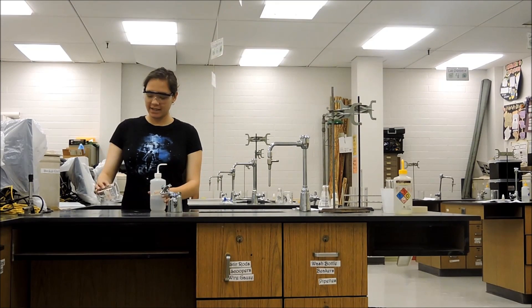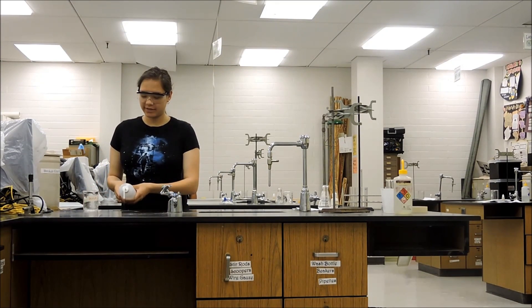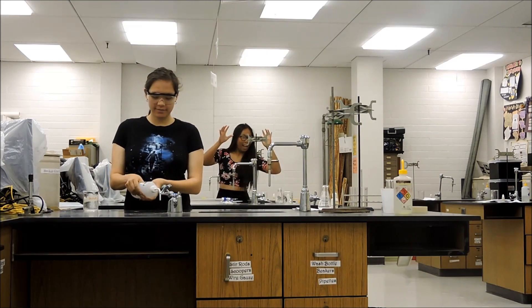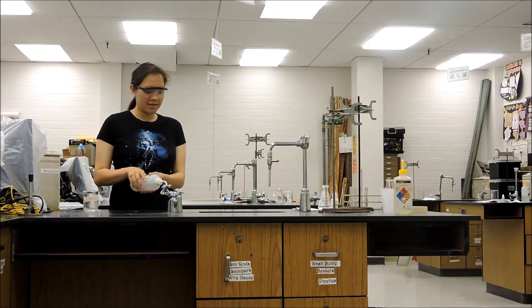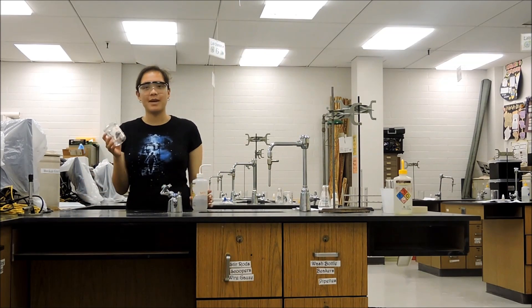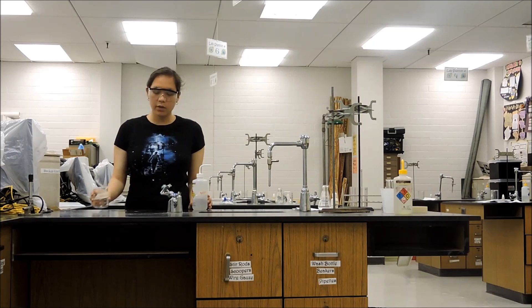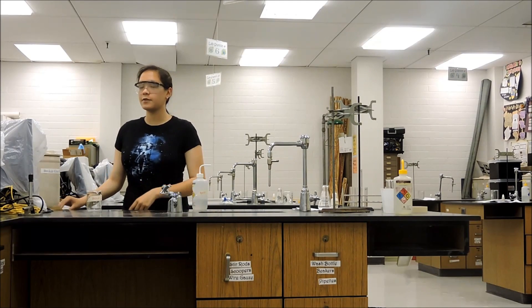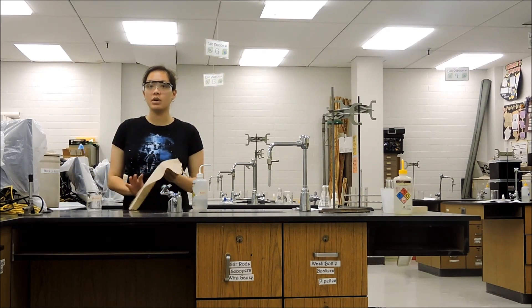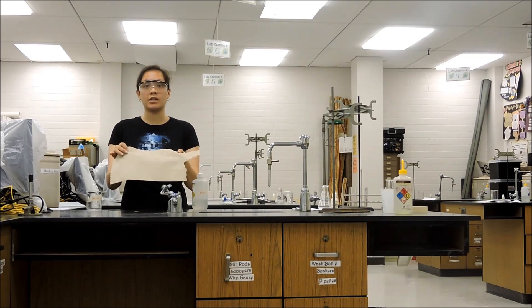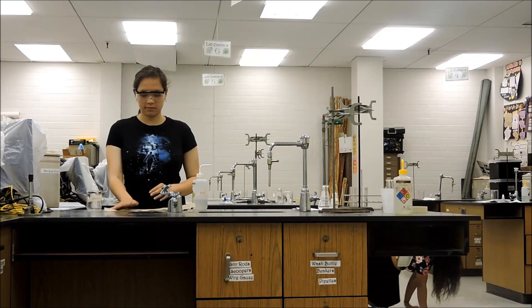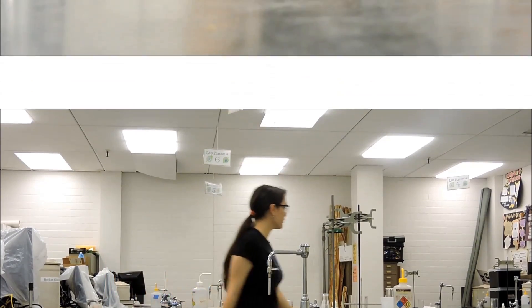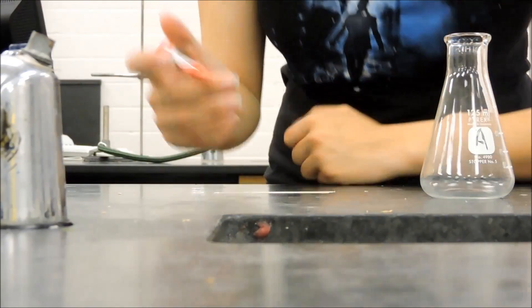Rule number 14, if you drop the acid, pour some base on it. If you drop the base, pour some acid on it. By doing so you will neutralize the chemicals making it safe to wipe up. This will be really important to know during your acid-base titration lab. Rule number 15, label everything.